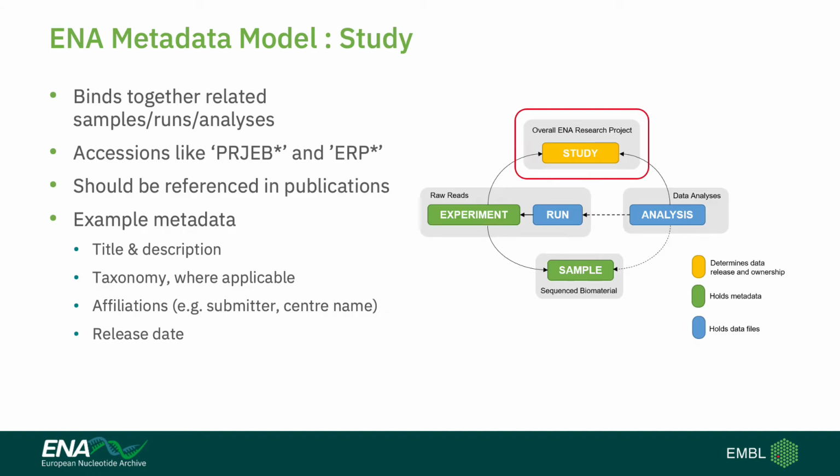As I mentioned, study really binds all the related objects together into a cohesive unit or project. When you submit, you will receive project accessions like PRJEB and ERP. A PRJEB is a bioproject accession, while ERP is an internal ENA accession, and I'll discuss this a little bit later too.